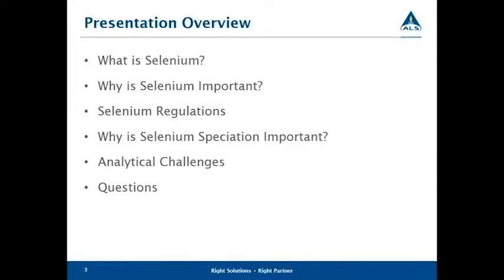So today I'm going to provide an overview of the properties of selenium, the reason for its importance, and ultimately why it's regulated. I'll highlight some of the chemical compounds that selenium can form, and why speciation of selenium can provide insight into the pathway and potential toxicity. I'll also explain why speciation can provide valuable insight into some of our common problems associated with our existing total and dissolved selenium methods that most people are more familiar with for waters.